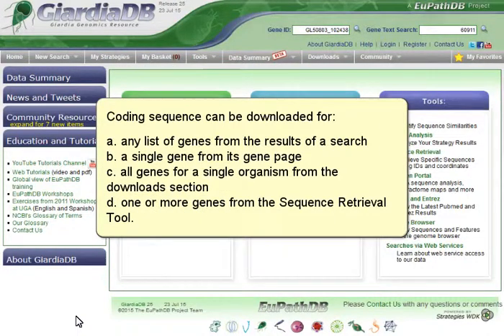Coding sequence can be downloaded for any list of genes from the results of a search, a single gene from its gene page, all genes for a single organism from the download section, or one or more genes from the sequence retrieval tool.